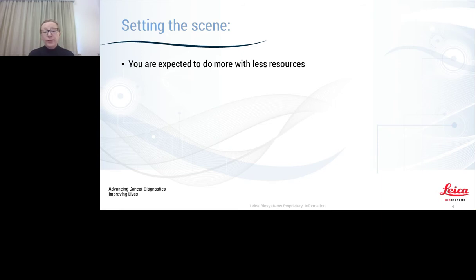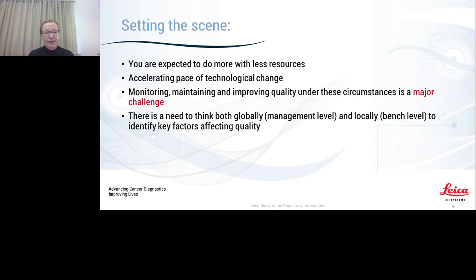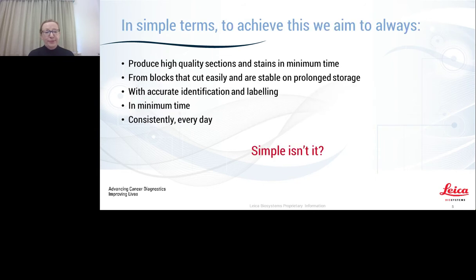You're often expected to do more with less resources. There's an accelerating pace of technological change, and monitoring, maintaining, and improving quality under these circumstances is a major challenge. So you do need to be thinking both globally at a management level and locally at a bench level to identify the key factors affecting quality.